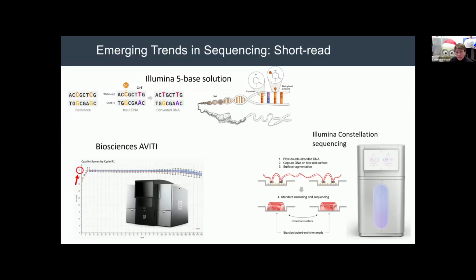Essentially they're doing the sequencing in 2 sort of wells, and somehow they're connected. Again, this is not released until 2026, and so there's not a lot of information. It also does require its highest capacity instrument, the NovaSeq, which I'm not sure how many labs have.